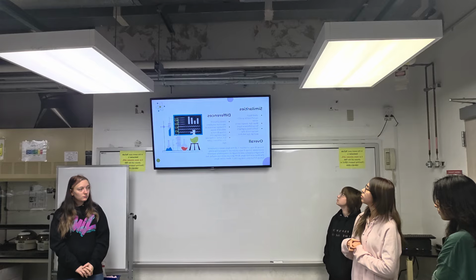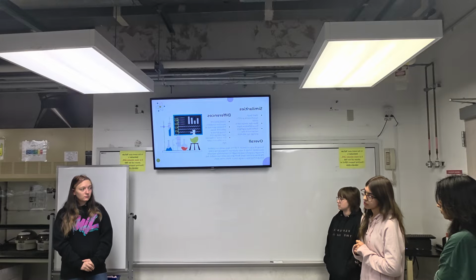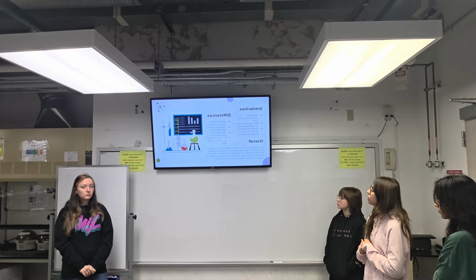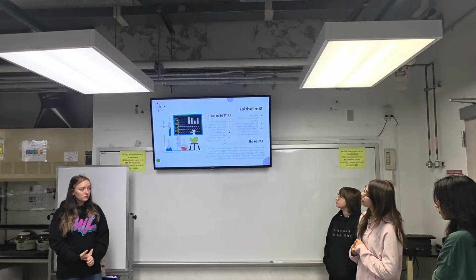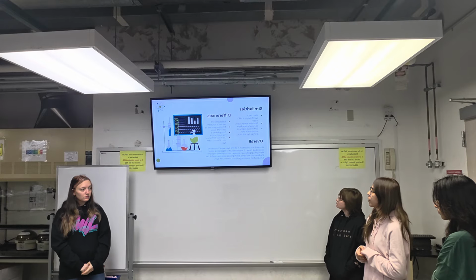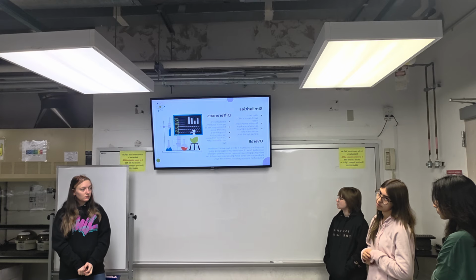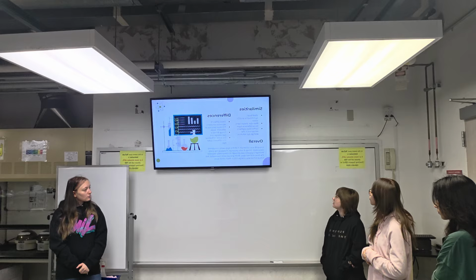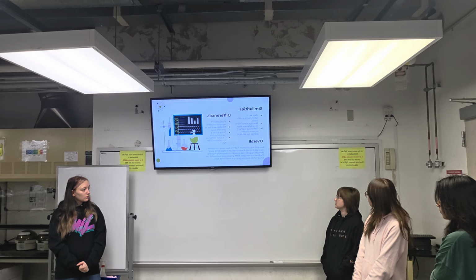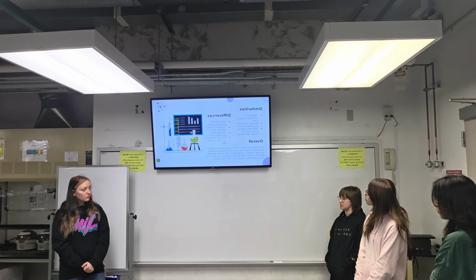For the similarities, both of us used cyclohexane and DI water. The blue dye always went to the cyclohexane layer, and some blue pigment remained in the orange dye solution. The differences, we used different aqueous solutions and did the filtration process at different steps. Group B had a red-orange tint, and the DI water remained a different color. And then overall, group B was uncertain if all the dyes were completely separated, and so was group A. We didn't know if using just the pipette was enough to separate the dyes. Both groups were successful. Group A had less orange tint in their other dyes.